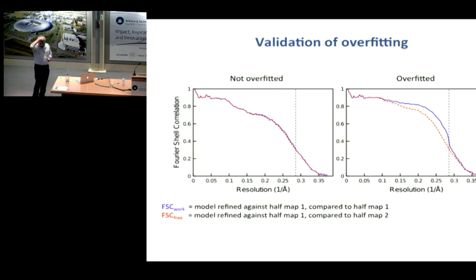Yes, you can put that. That is there, if you have a PDB file. It has either a biomatrix or a matrix or something like that in the PDB file header, and you can use that. There's a tool, and I'll send you that, that will extract the header matrix and make it useful for refinement. If you know Euler angles or polar angles and translations, you can use that. If you have matrices and translation, you can use that.